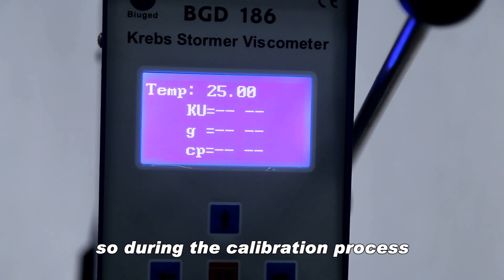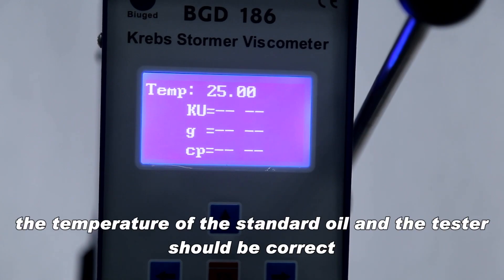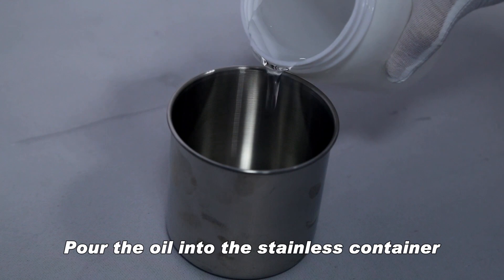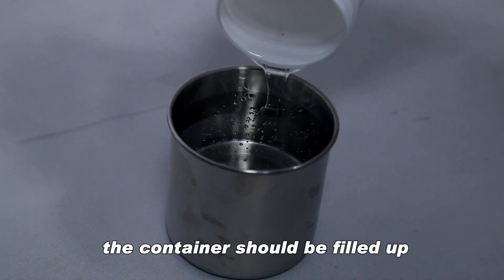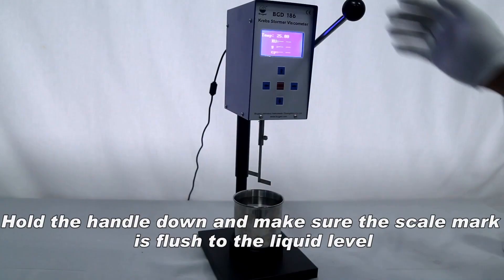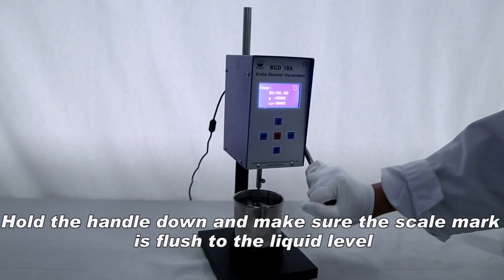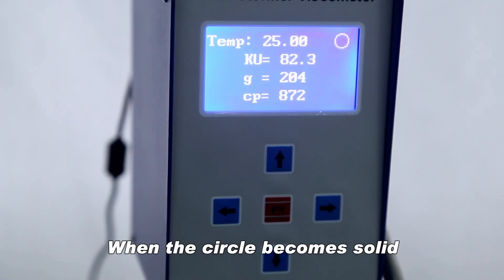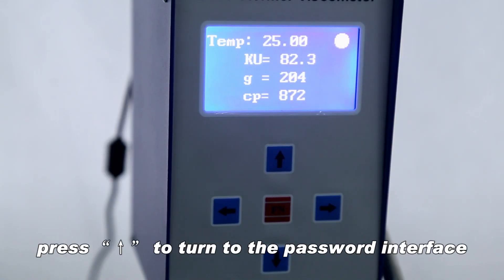The temperature has a great influence on viscosity, so during the calibration process the temperature of the standard oil in the tester should be correct. Pour the oil into the stainless container — the container should be filled up. Hold the handle down and make sure the scale mark is flush to the liquid level. When the circle becomes solid, press to turn to the password interface.